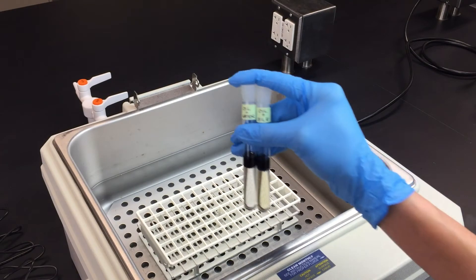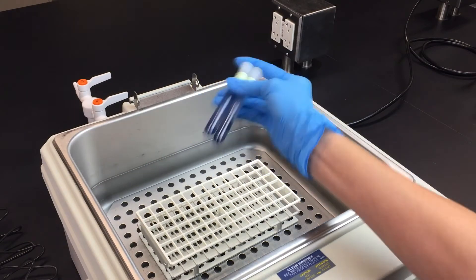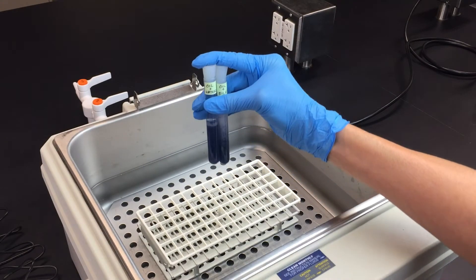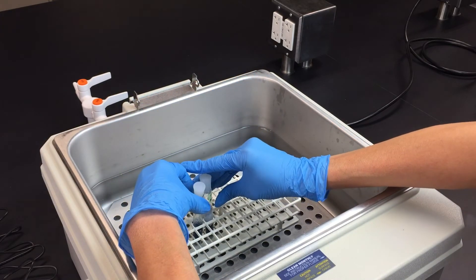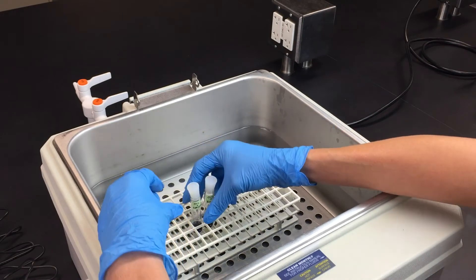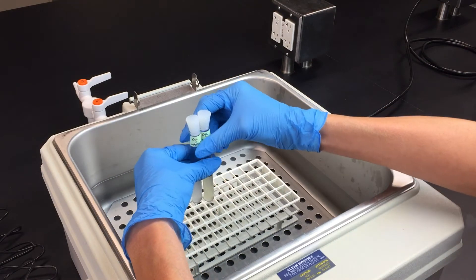Give the tubes a quick shake, then put them in the 37 degree water bath for 60 minutes. Every 15 minutes, invert the tubes two to four times.